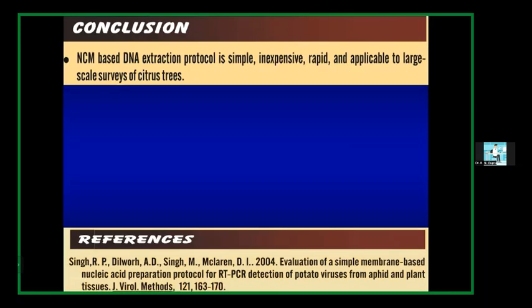So, in conclusion, the NCM-based DNA extraction protocol is simple, inexpensive, rapid, and applicable to large-scale surveys of citrus trees for nursery purposes and other healthy plant material purposes.